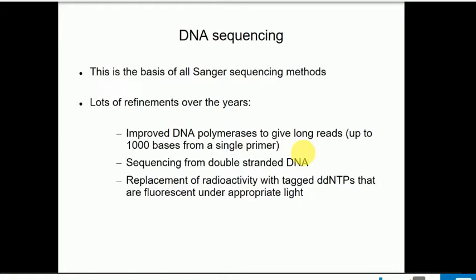And perhaps most important and useful from a safety point of view, we used to splash radioactivity around the lab like it was going out of fashion. These days, everything's done using fluorescence rather than radioactivity. So the dideoxy bases now have fluorophores attached to them, so they fluoresce under the appropriate wavelength of light, and everything's done without using radioactivity.